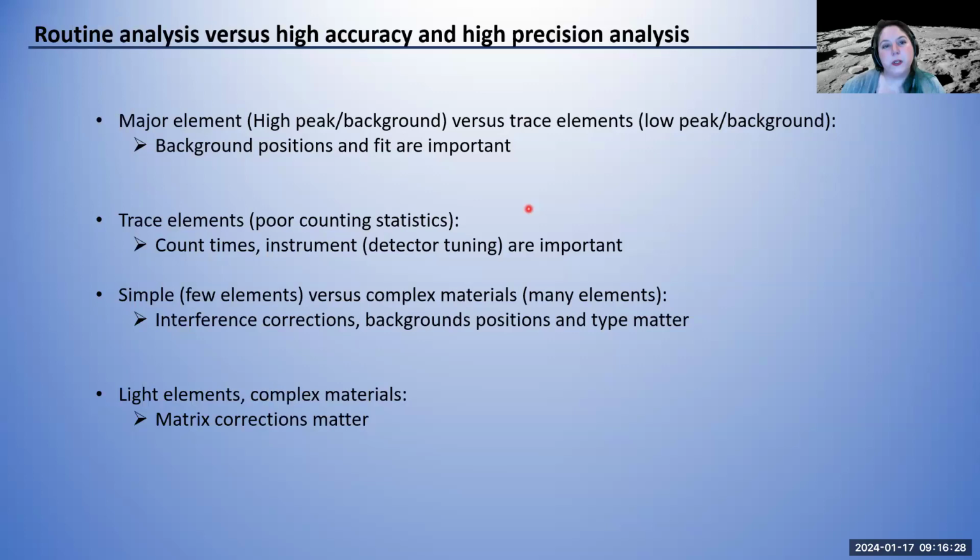Okay, good. I will show you how it works for routine analysis, but we'll also talk a little bit about how we can improve accuracy and precision in our analysis. And just from a philosophy point, usually we care often about trace elements, and so certain things can become more important depending on the application, depending on what we're trying to analyze.